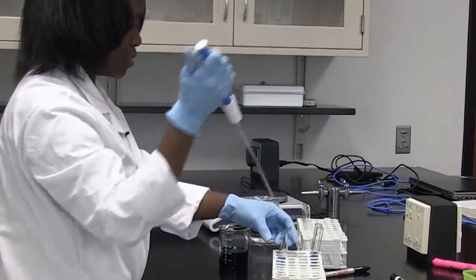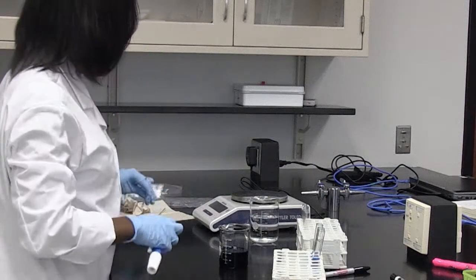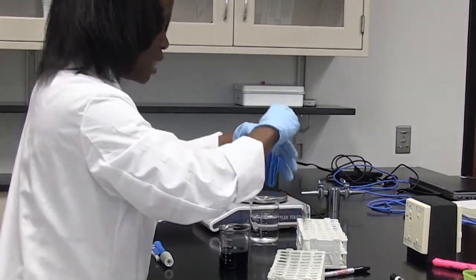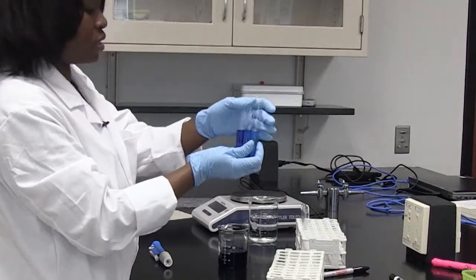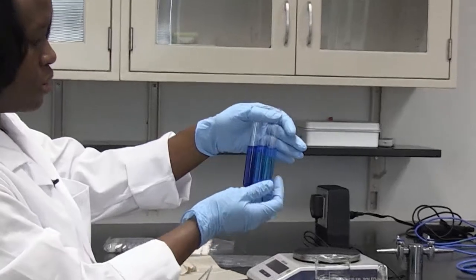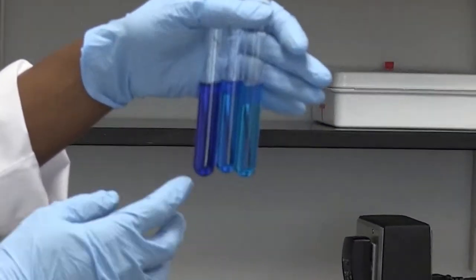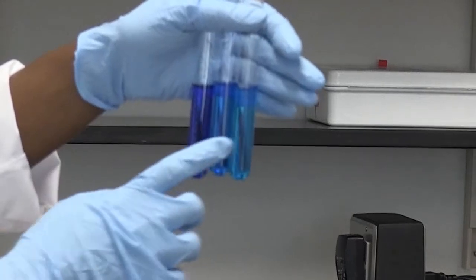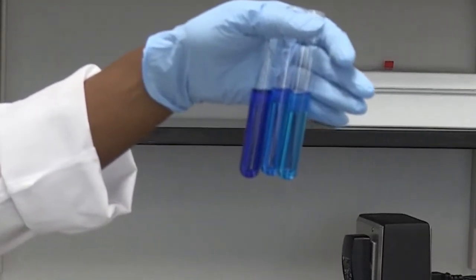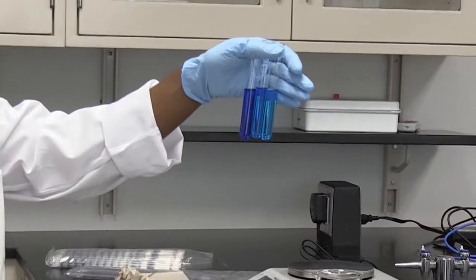I have successfully made my 1 in 100 solution. If you look at them side by side — this is my 1 in 10, my 1 in 50, and my 1 in 100 solution. If you notice, it gets less concentrated from 1 in 10 to 1 in 100. That is how you make a dilution series.